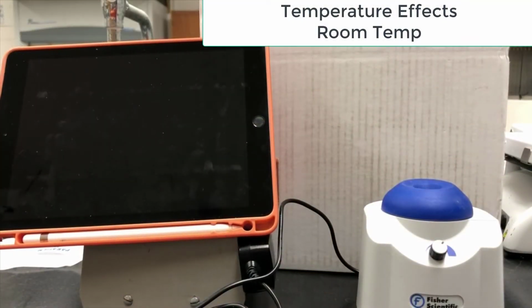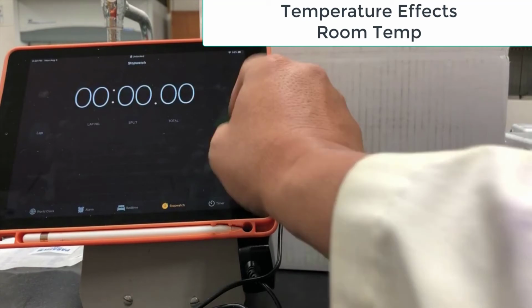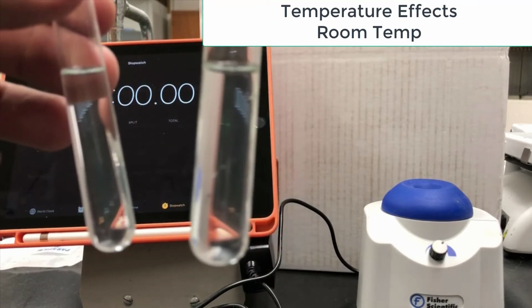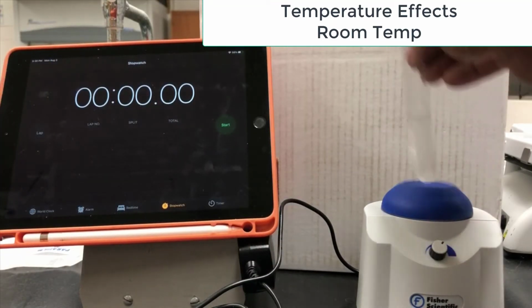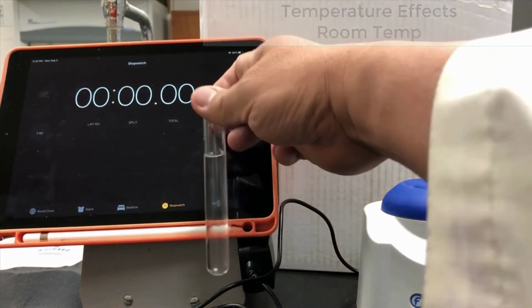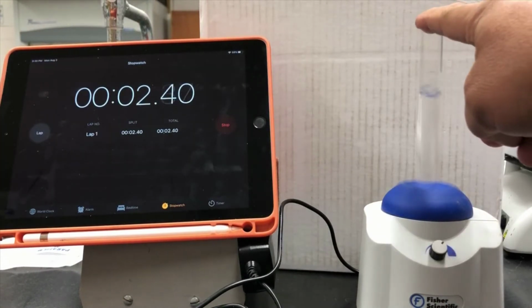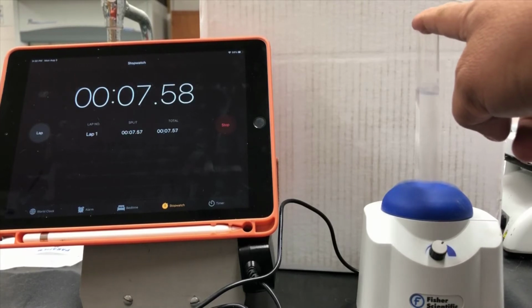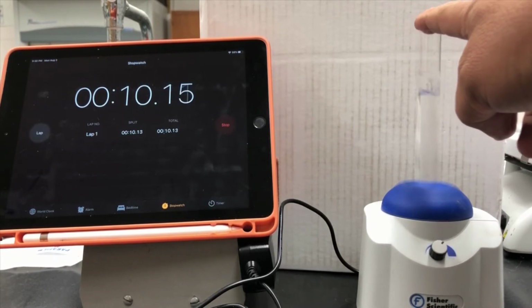So this will be the room temperature run, and right after the experiment we'll measure the temperature, but it's been around 24.6 to 24.8 degrees. We'll see how close we are. Okay, so we'll go ahead and do this. I need to mix this one up before I mix together. I'll go ahead and do this, and then hit start, go like that. Now, if you remember when we did this, I believe it was between about 25 and 30 seconds, so that's kind of what we're shooting for. Hopefully things haven't changed.